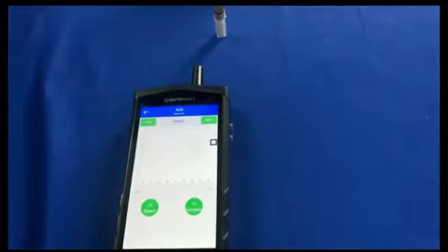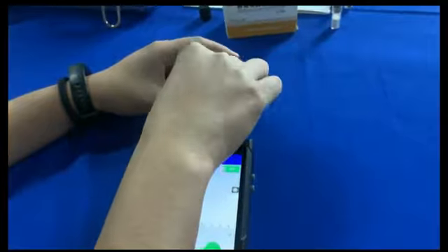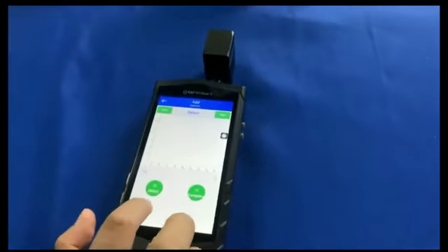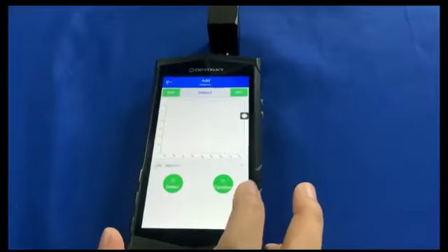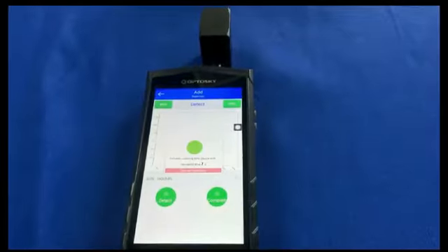Every time the HQI should be over a value of 85%, it can successfully save this method. It needs to perform the HQI. After we perform this, paracetamol is usually used with different batches of raw materials.